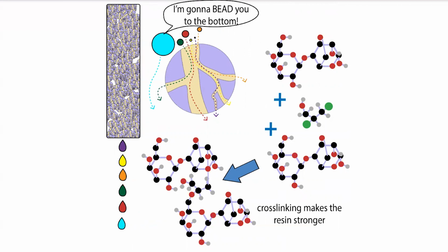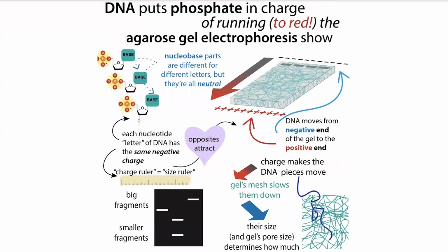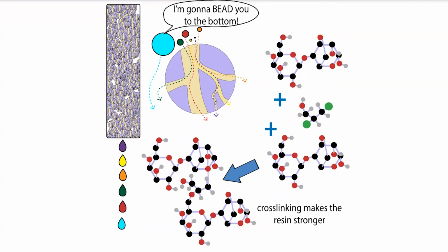But if those molecules are interacting with the beads themselves, well, this would cause a problem because now it wouldn't be directly related to the size. And so we want to use something that's really inert. And so the same inertness of agarose comes into play, makes it really handy for separating these molecules with size exclusion. And so a lot of those beads that you see are going to be made up of agarose. Although because agarose isn't that sturdy, they often have some of those more permanent modifications to kind of cross-link those different sugar chains together permanently, so you get a sturdier mixture.